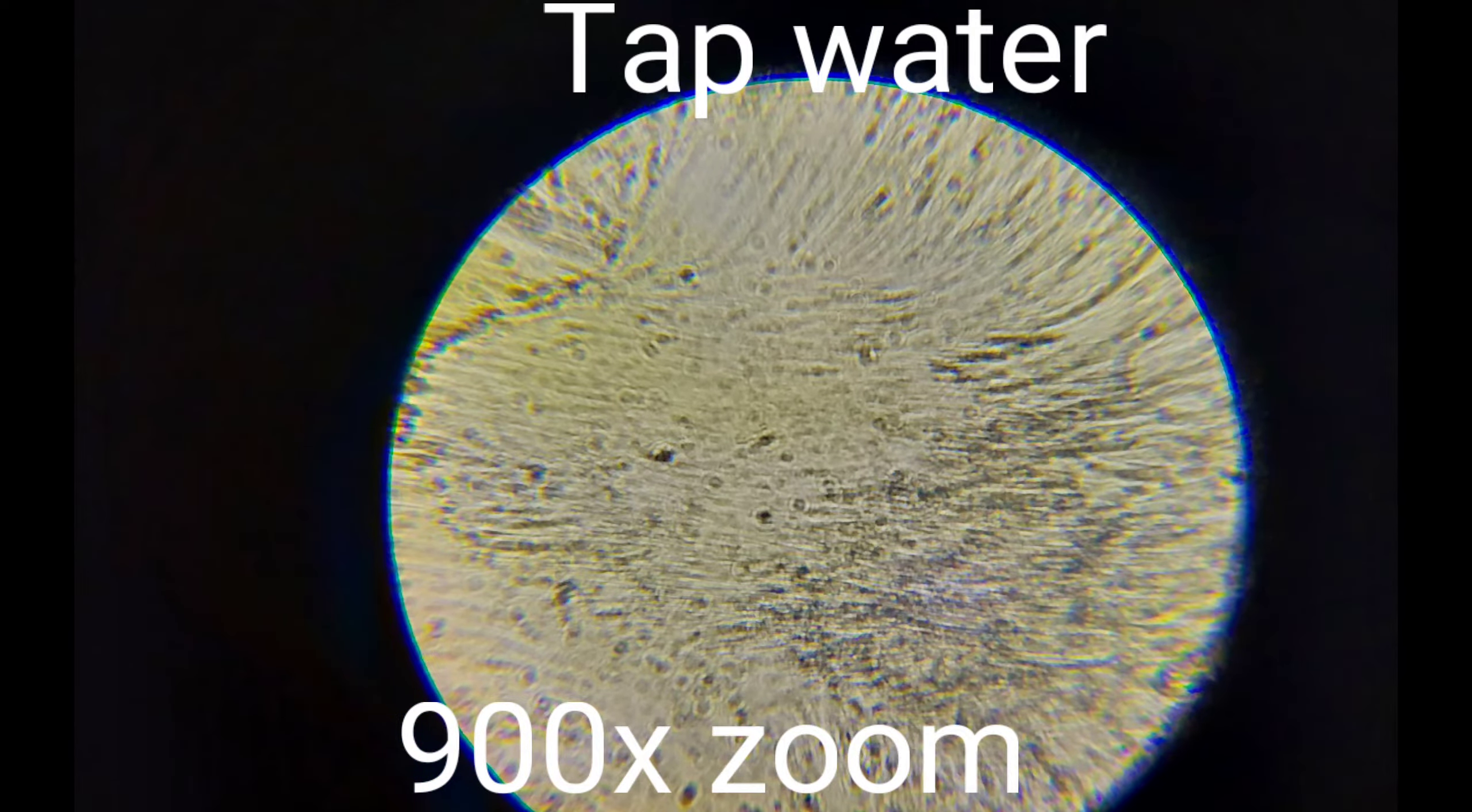So here I have normal tap water. So you may be thinking, Sans, why is there so much bacteria? Well, that's actually just because it's regular bacteria, which is perfectly fine for you.